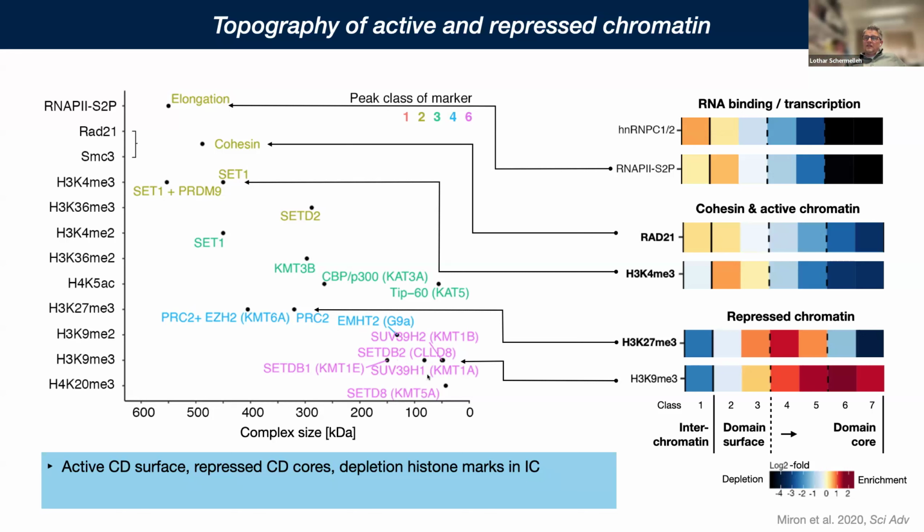So we get a nice hint towards some sort of size exclusion effect of the associated enzymes.